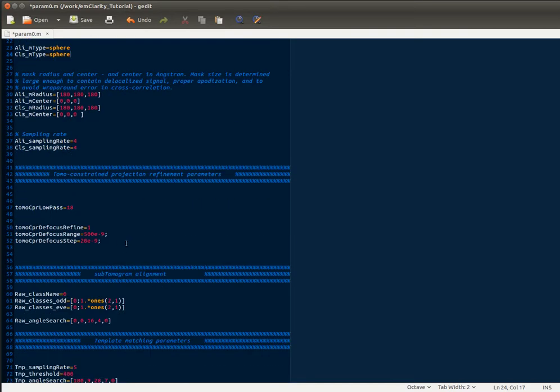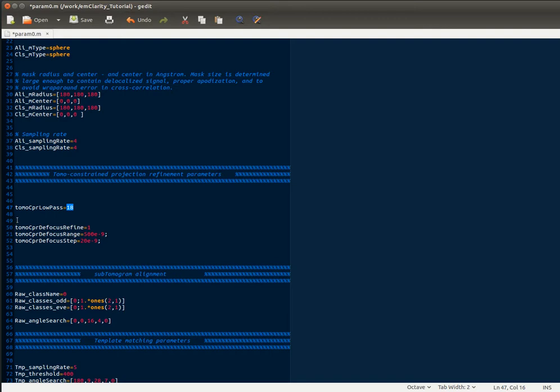The next set of parameters are relevant to the tomoCPR. They are simply just a low-pass filter that restricts the search space when we're aligning the individual subtomogram fiducial markers against each projection, and then some experimental parameters that you don't need to worry about for refining the defocus.